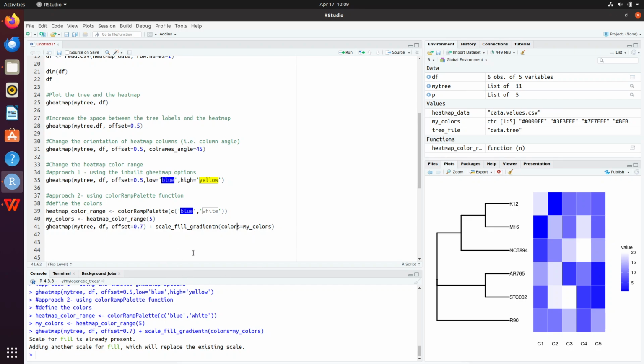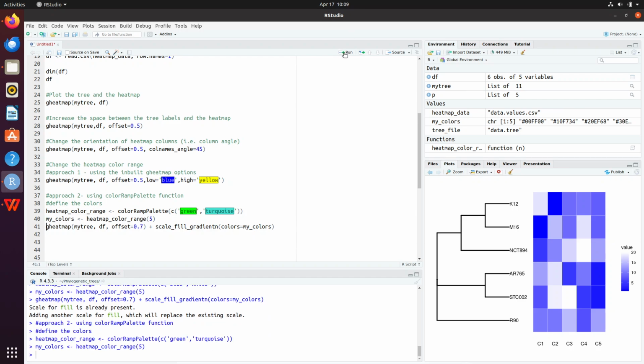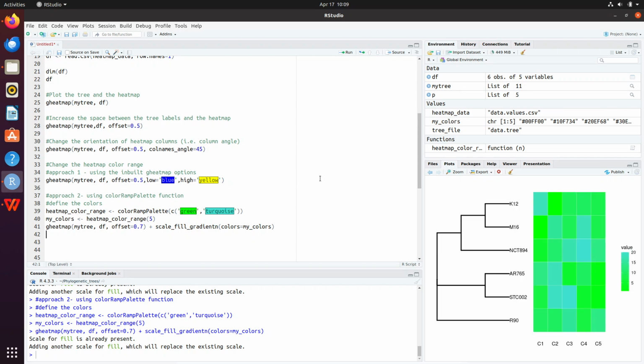Now with this plot, once you do it, you will have a notification coming up, but you can ignore it. It's only telling you that something has been updated, but it's fine. It's nothing to worry about. Again, you can change it if, let's say, you want green, this color, you can just run, then get it done.